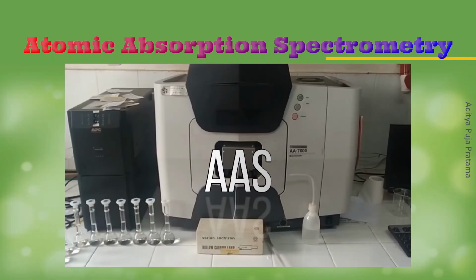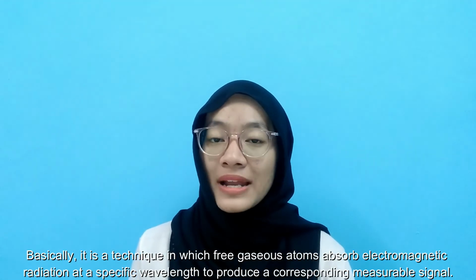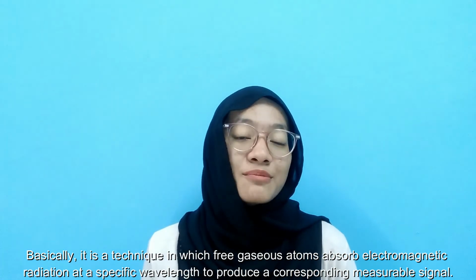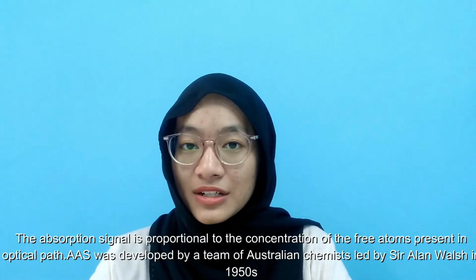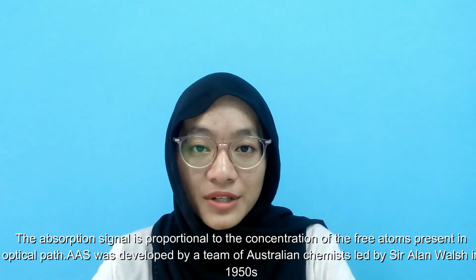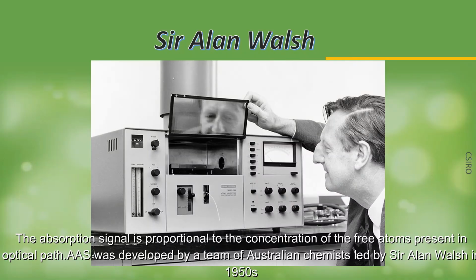That's all. Atomic absorption spectrometry, or we can simply call it AAS. Basically, it is a technique in which free gaseous atoms absorb electromagnetic radiation at a specific wavelength to produce a corresponding measurable signal. The absorption signal is proportional to the concentration of free gaseous atoms in the optical path. AAS was developed by a team of Australian chemists led by Sir Alan Walsh in the 1950s.